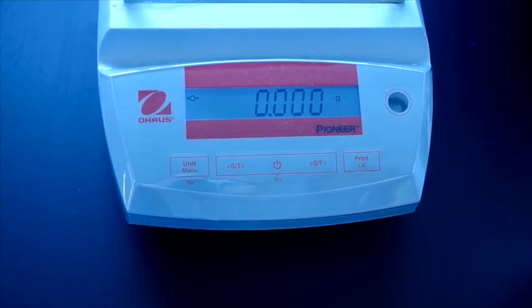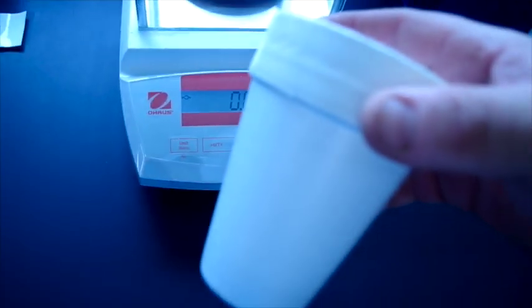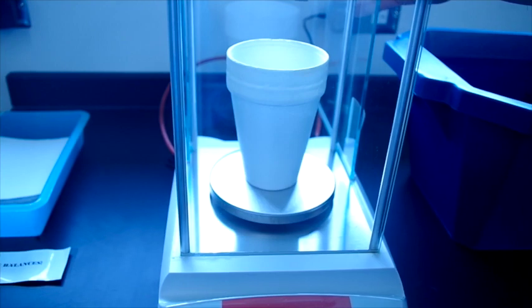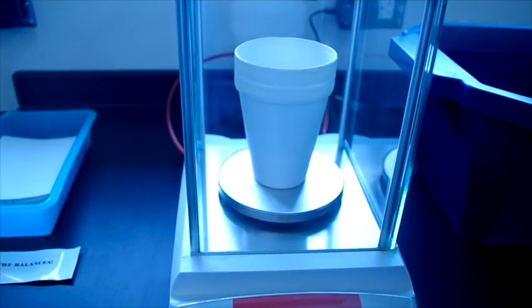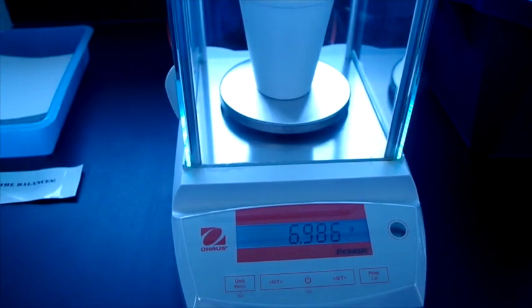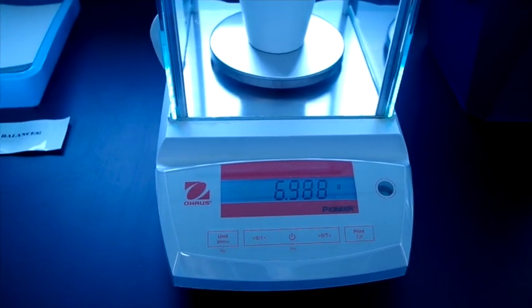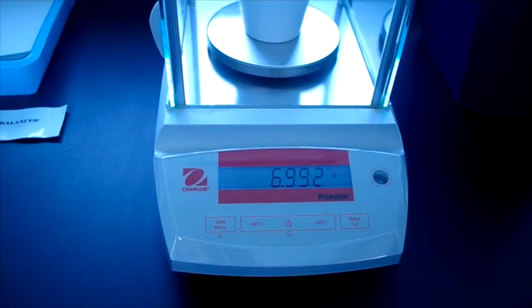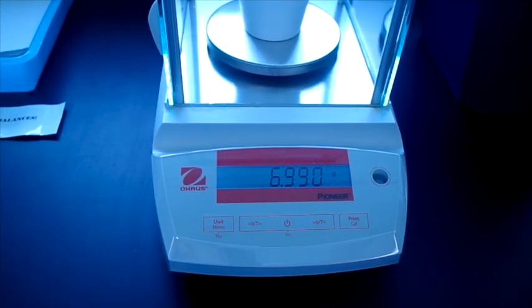Zero grams. Now, take my cup. Alright, put it on there again. 6.988 grams.